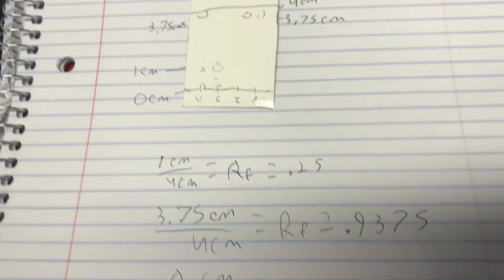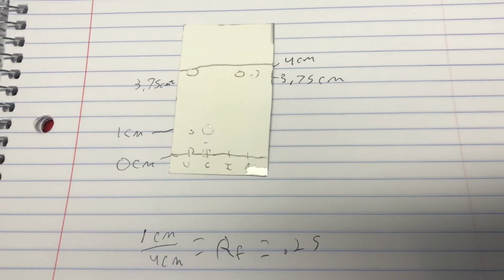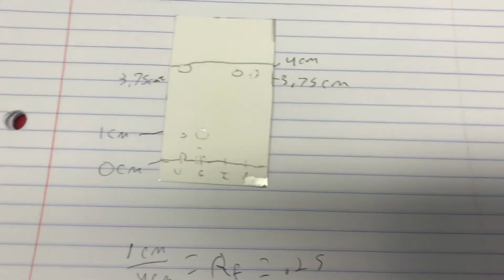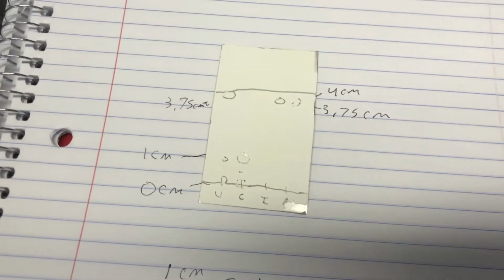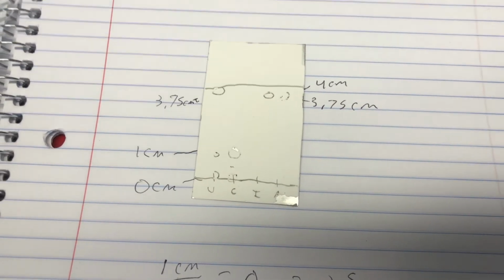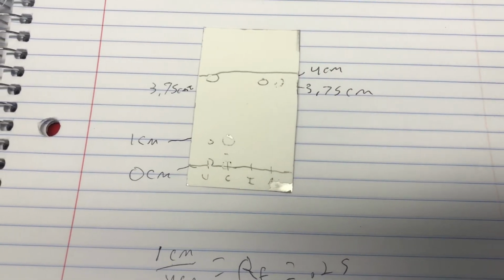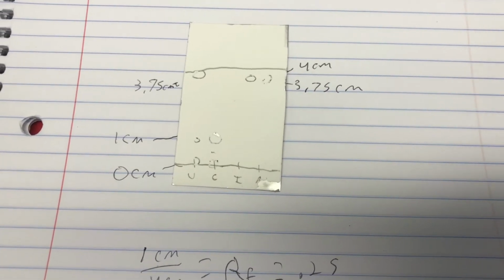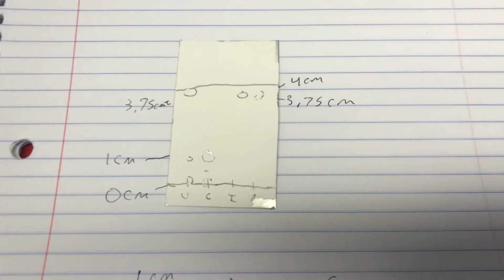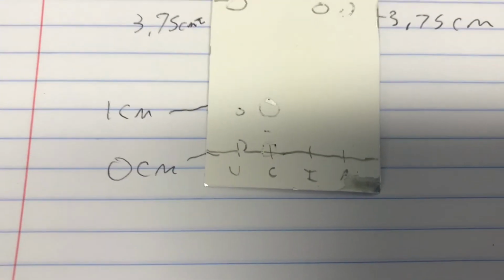So one good thing is that we did have different substances that had the same RF number. As you can see, the unknown actually had all of the RF numbers, which is usually a good thing when you can match the unknown up to 1 or 2 different things. But unfortunately, what we're actually getting as a result is that our ibuprofen and our aspirin ended up being about the same height. So we can't really differentiate between whether the unknown is aspirin or ibuprofen. But as you can see, it does match up right there with the caffeine pretty well.